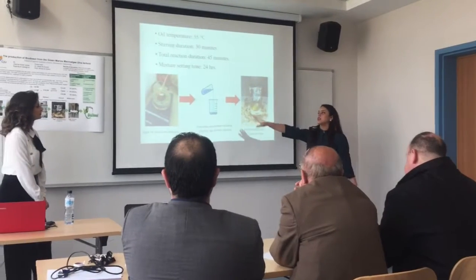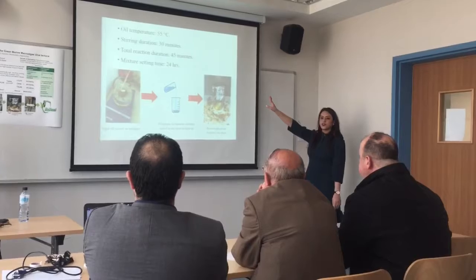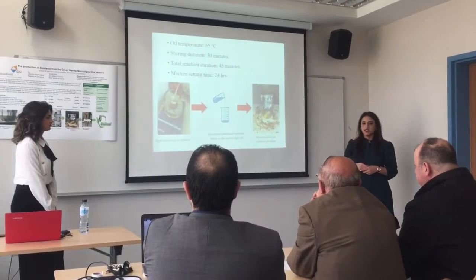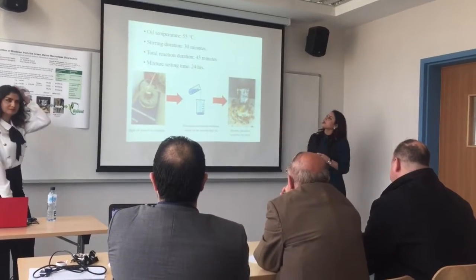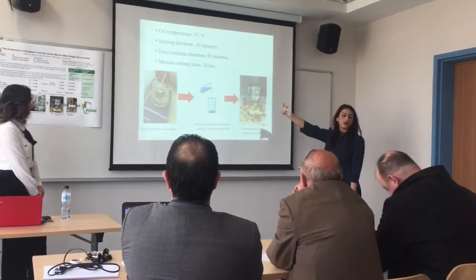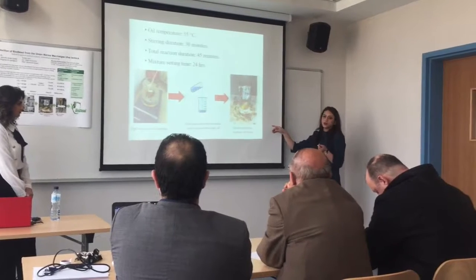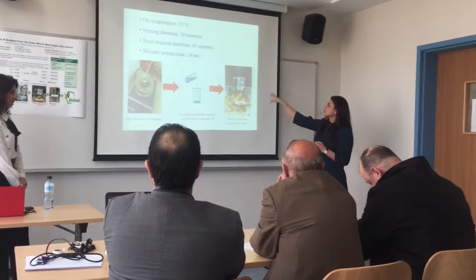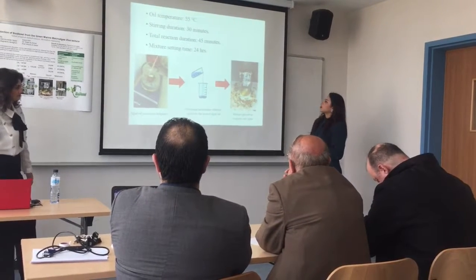So first we had to heat the oil to a certain temperature. The temperature we chose was 55 Celsius, since methanol evaporates at temperatures over 60, and we did not want to lose the methanol when we added it. After we heated the oil, we removed it from the hot plate, added the catalyst solution to the oil and placed it on a magnetic stir plate. There's no heat in this part of the procedure. We just covered it with aluminum foil to prevent loss of the alcohol.